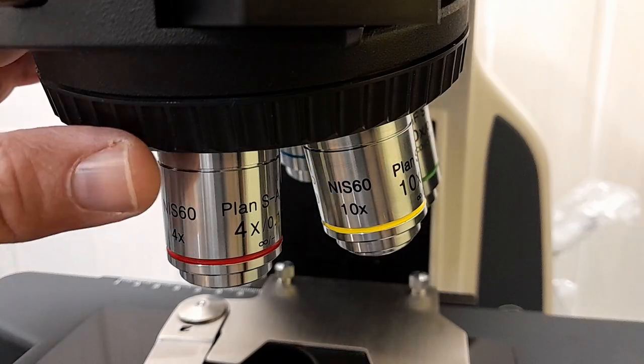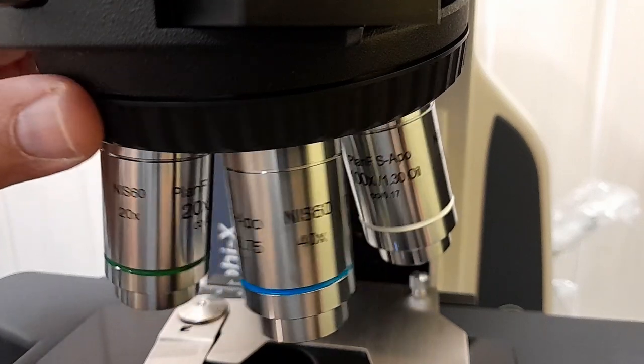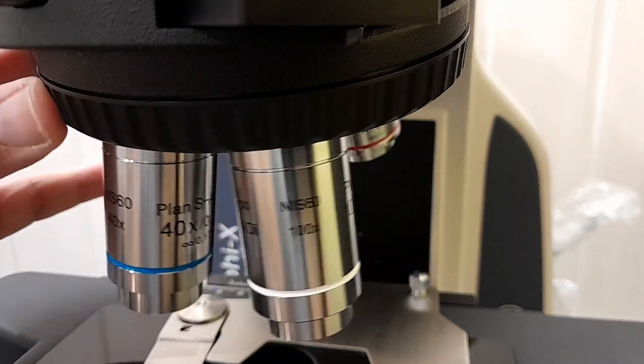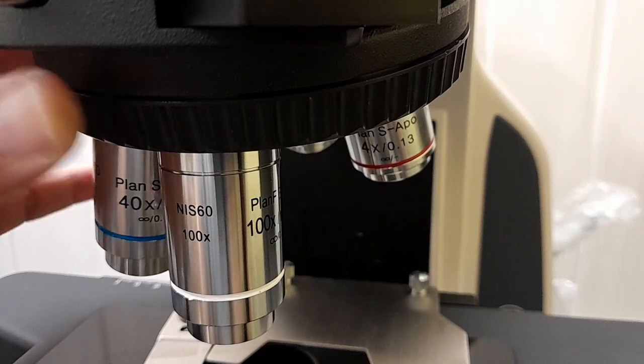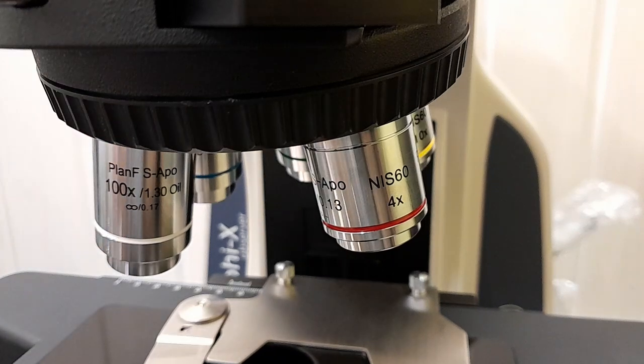You can install six objectives on the nose piece of the microscope. It comes pre-installed with a 4x, a 10x, a 20x, a 40x and a 100x oil immersion objective. And there is still one space left for an additional objective. I would of course always connect a 60x objective here. And then you're covered for all magnifications. In my case here, this microscope has apochromatic objectives, but the company also provides different objectives. For example, phase contrast if you want to.